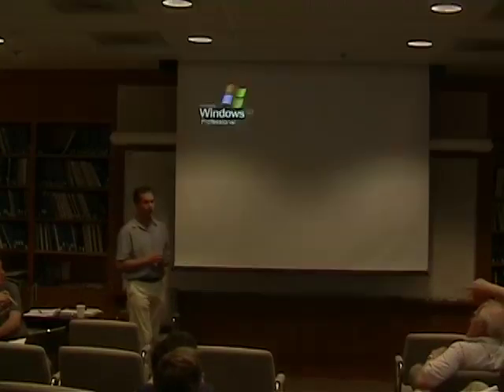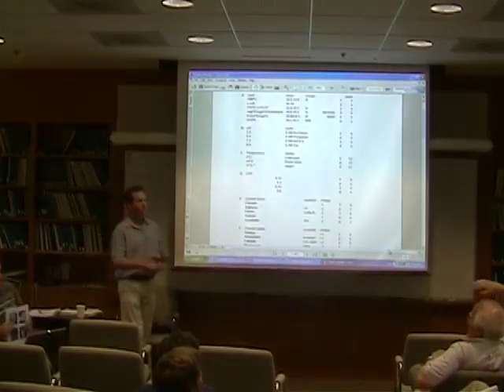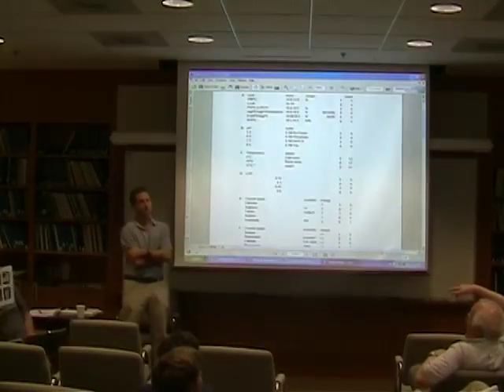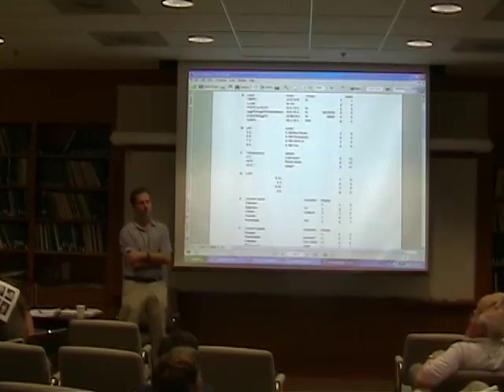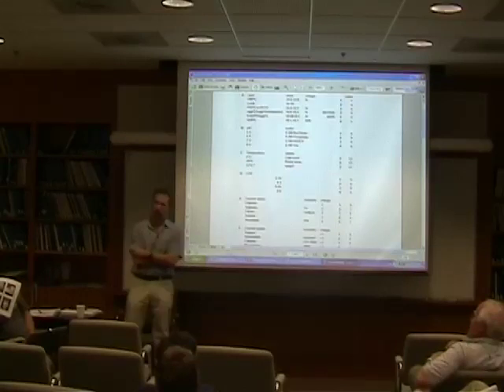I think the conversation is starting to go in the direction that I'm thinking, that the buffer, the pH, the kind of ions, and the detergent should not be considered parameters in the original search. Because you've worked really hard during the solubilization stage to find out what buffer, what detergent, and what pH you should use. And you already said the first priority is to have a happy protein. So if you found it, then use that as your buffer for crystallization and reconstitution.